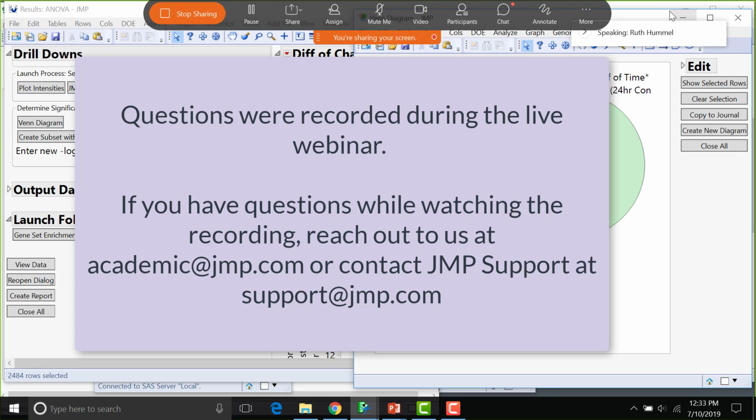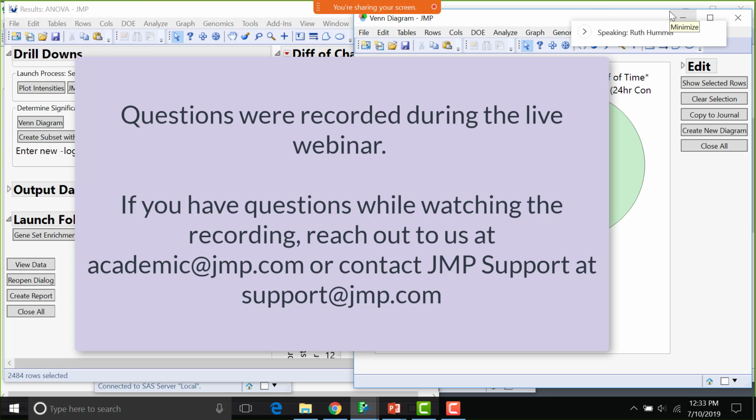Okay, so now is a great time to take questions. If there's anything you want to ask me about expression analysis, then we'll look very briefly at a GWAS type of study and then very briefly at a plant breeding example.